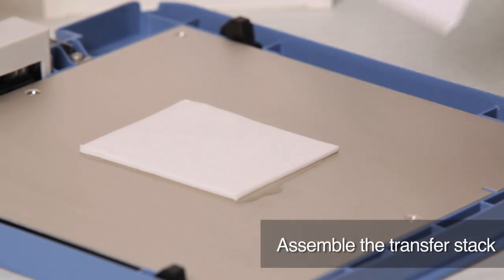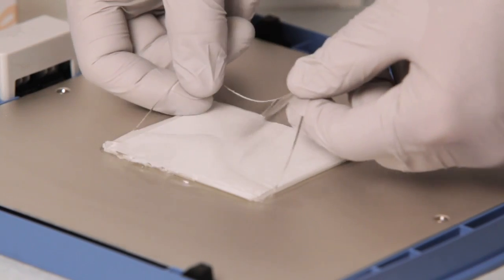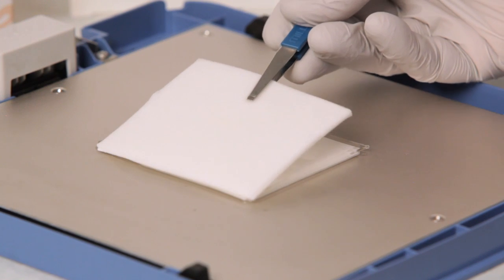The transfer stack is assembled on the anode using two pieces of pre-equilibrated filter paper, the membrane, the gel, and another two pieces of filter paper.